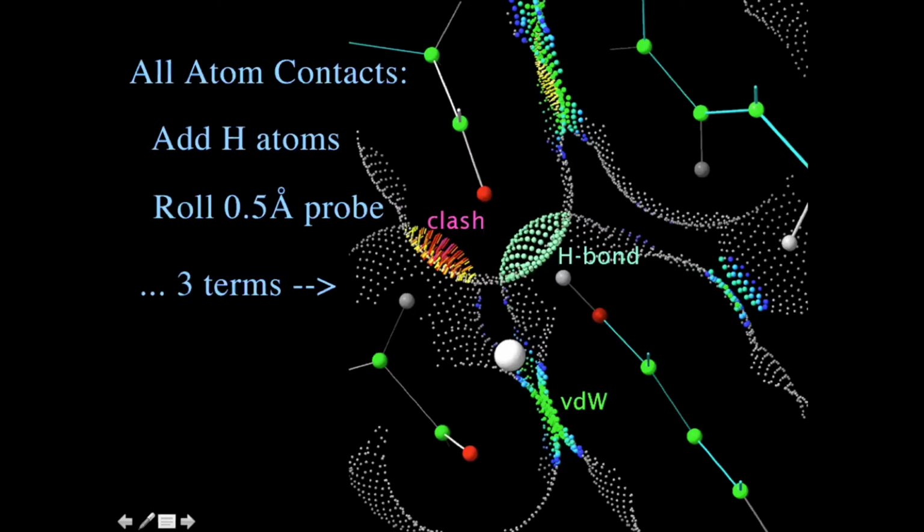First, they're blue at a 1/2 angstrom contact, and they get green at optimal van der Waals. And then if they overlap a little bit, they start getting yellow and being spikes. If they overlap a lot, they get really painful, bright colors and long spikes and look uncomfortable. We may have overdone that, but anyway, the clashes do look uncomfortable. And if they overlap as H-bond donor and acceptor, so it's a good overlap, then they make these nice, calm, pale green hydrogen bond dot pillows.